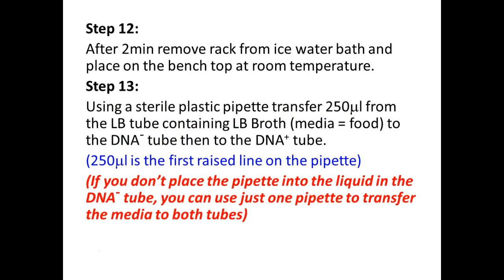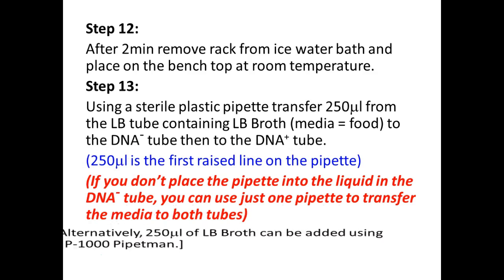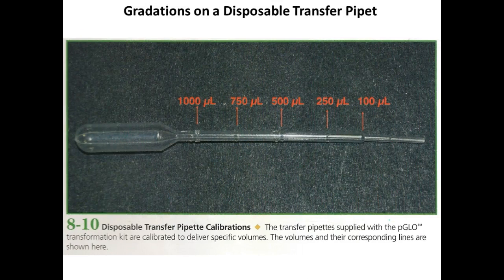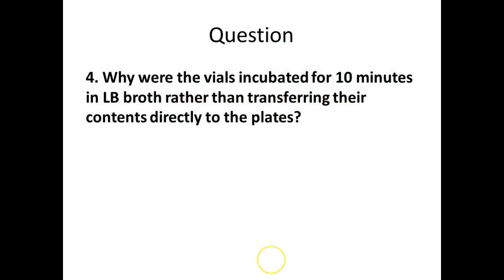So again, in that case, you wouldn't have to use but one pipette, as long as you don't stick it down into the fluid. And same thing with the tip. So the alternative is what we're going to do today. We're going to use the pipetman, because as you can see, and as you guys have experienced, these little plastic pipettes aren't fun to work with. 1 mil is tough enough. Can you imagine having to draw up to this little ridge, and then later on to that one? So we're going to use the much more accurate, easier to use pipetmen today.